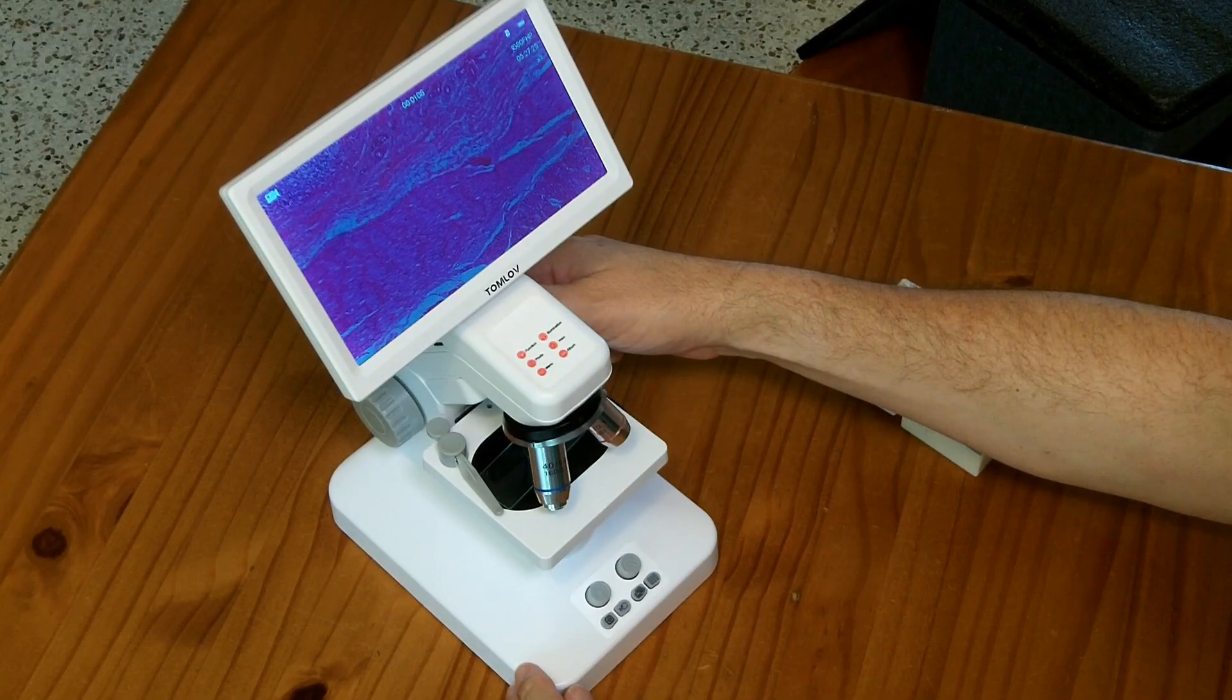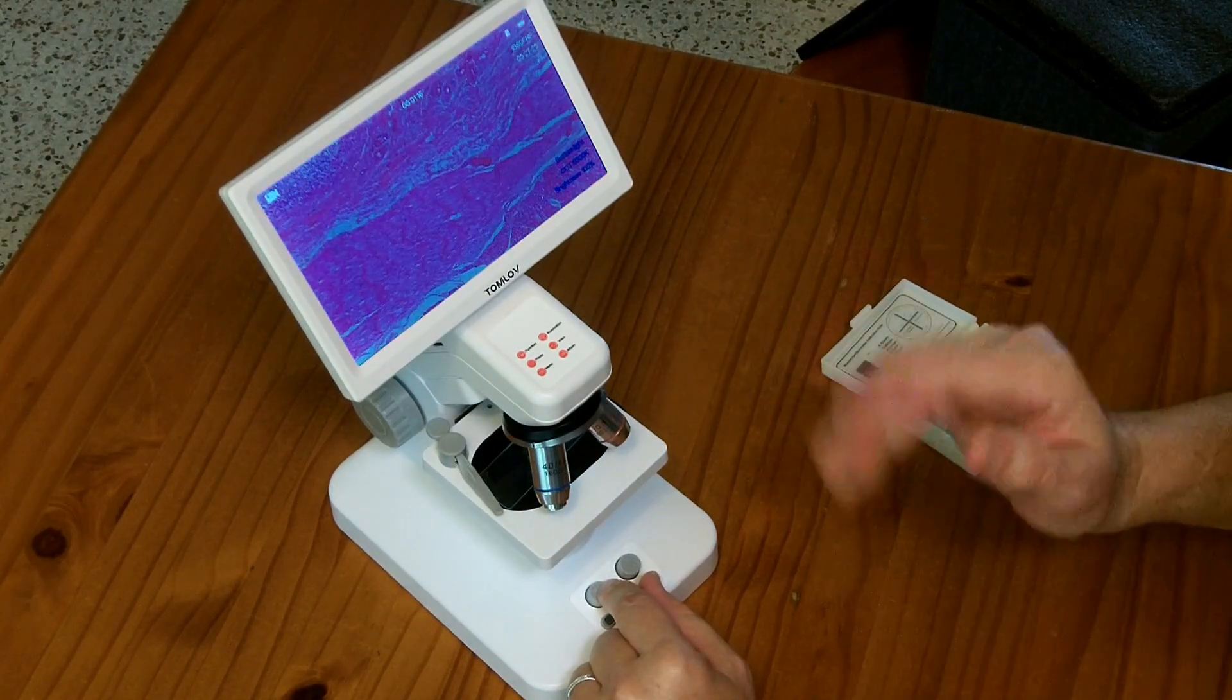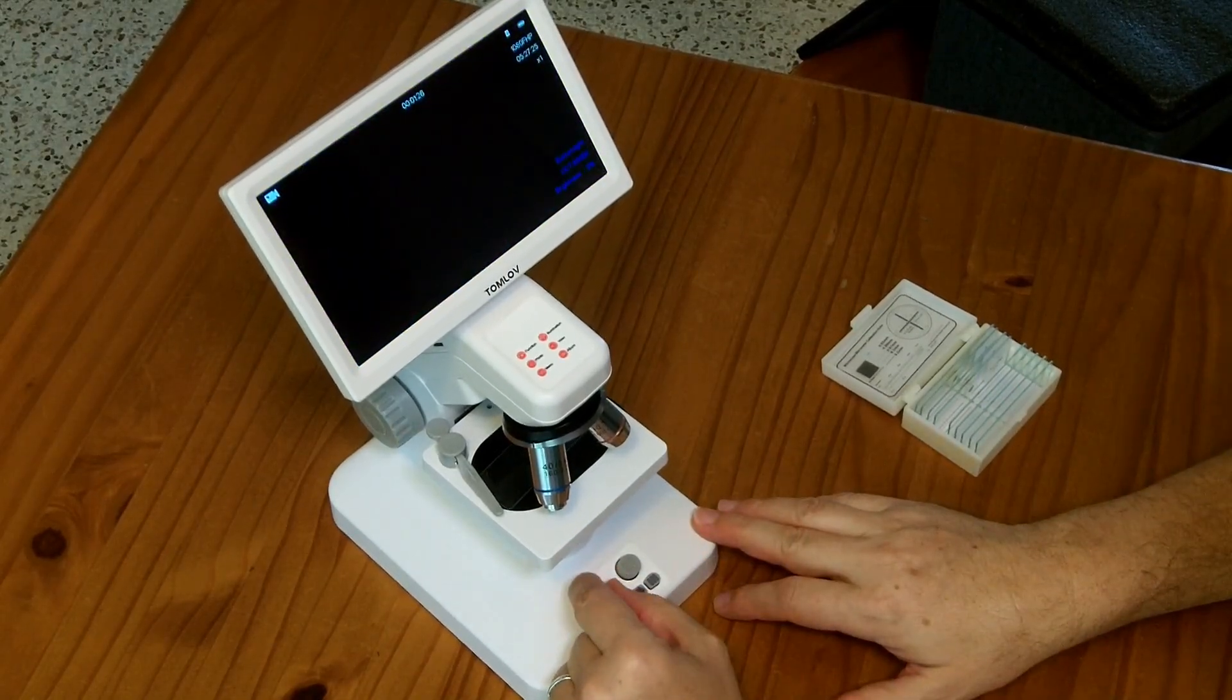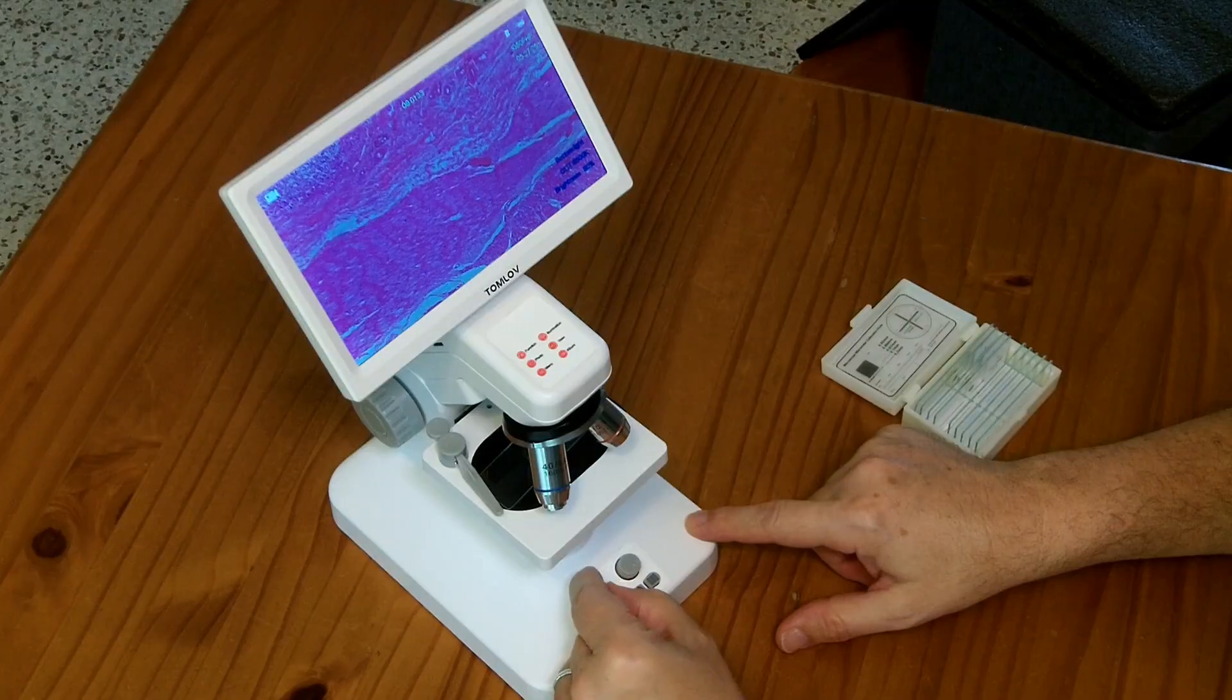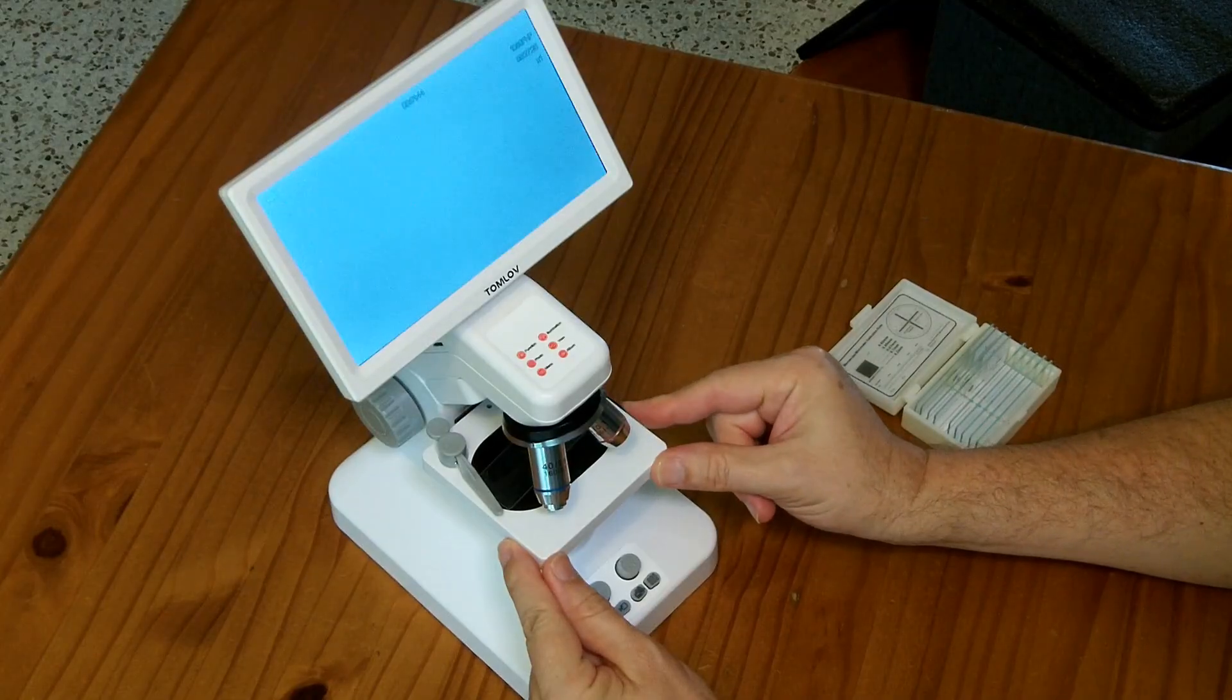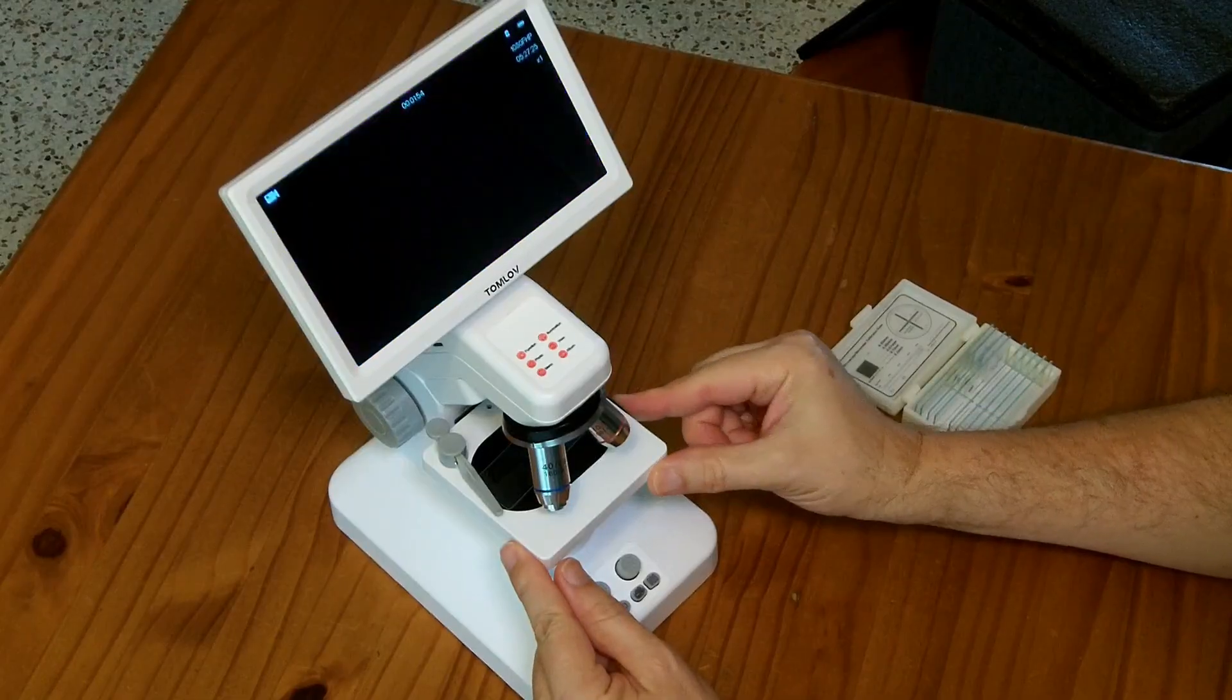Okay, so there we have something focused. And let's play with the lighting a little bit. So this is the upper light. We can look at the top of the sample. If it's a translucent sample, we can change to the bottom light. And then we look at the bottom of the sample. It has auto gain, so you can see it was overwhelmed and then the gain went down. And we can adjust the light brightness to lower it down. Zero isn't very effective, but five is working okay. And so it looks like it has a pretty good gain range because I'm changing that light all over the place. It has a knob under here where we can move different things in there. It doesn't appear to have any color filters. I think in maybe a more expensive model would have a color filter in there. The knob basically is switching between a couple of sizes of openings, but it doesn't appear to affect the color at all.